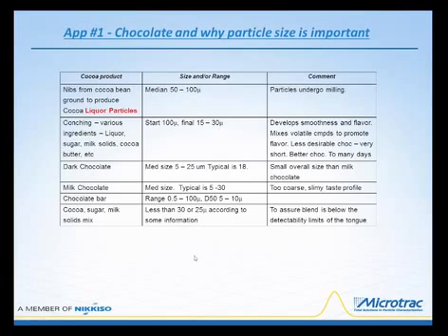Now, I've got a few applications I want to talk to you about, and there is a point behind each one of these. One of the applications is measuring chocolate. And chocolate is a complex food, believe it or not. But the flavor profile of chocolate includes a lot of volatile and non-volatile compounds, the smoothness, the texture, the flavor, a number of things.